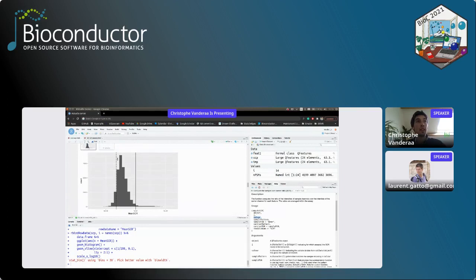And we can see, so the dashed line I show is the expected 0.5%. So on average, it's a little bit higher than expected. This is maybe, or probably, because in mass spectrometry, the quantification is not fully linear. But you can see here we have like 10%. So where the signal of the sample is 10% of the carrier, that's way too high. We're expecting 0.5%, not 10%.